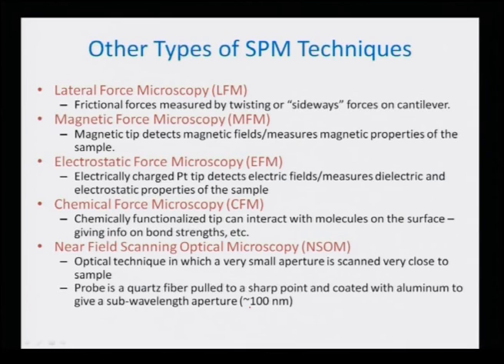Or you can also have electrostatic force microscopy, called EFM, in which an electrically charged Pt tip, the platinum tip, detects the electric fields or measures the dielectric and the electrostatic properties of the sample. In fact, people can do chemical force microscopy also. The chemically functionalized tip in CFM can interact with the molecules on the sample surface, giving information about the bond strengths.